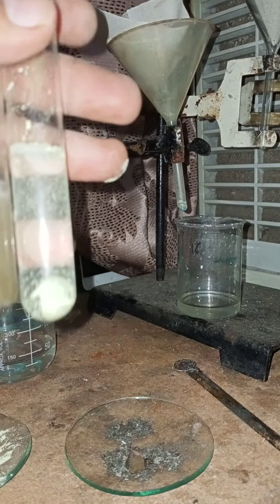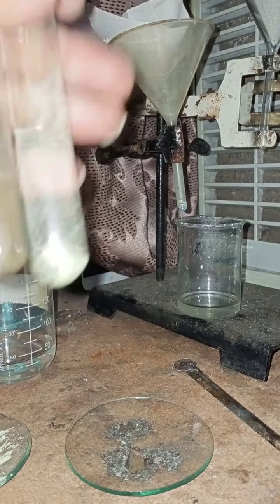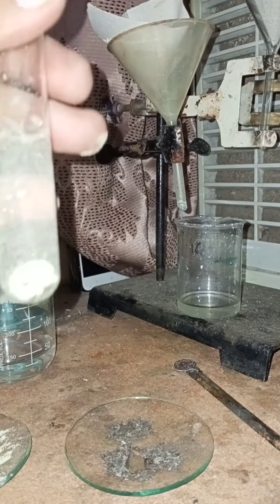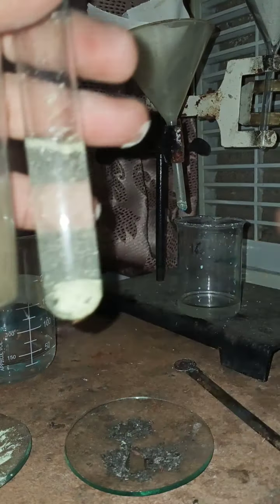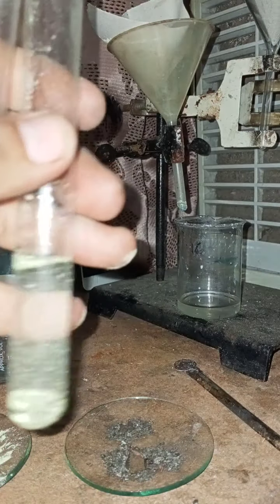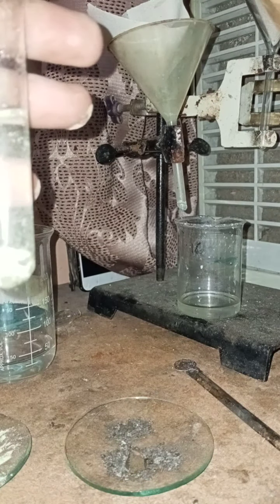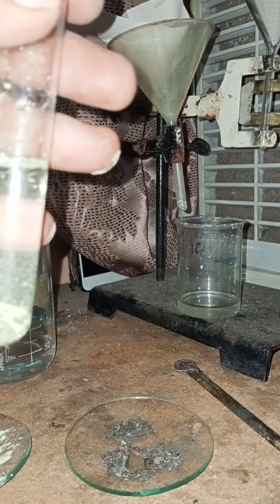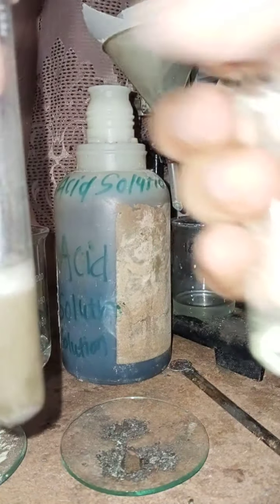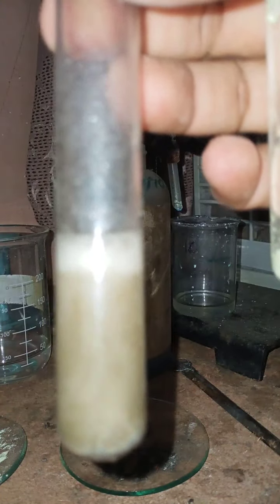Here you can see a vigorous reaction takes place and gas is produced, and here some hydrogen gas is produced, whereas here, due to the vigorous reaction, hydrogen sulfide gas is produced.